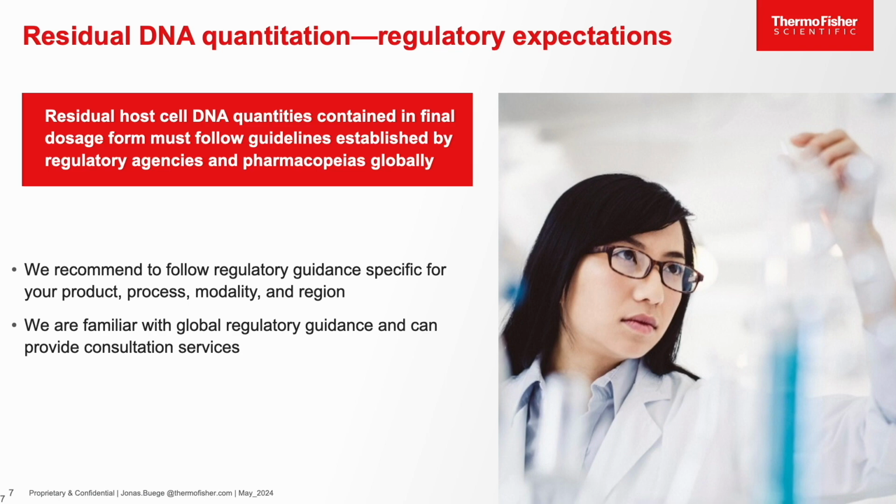Regulators around the globe, therefore, require you to limit the amount of residual DNA in the final dose. The World Health Organization, for instance, indicates that the amount of residual DNA per dose is kept below 10 nanograms. Residual plasmid, as an example, is also part of that 10 nanograms per dose limit, along with host cell residual DNA. For gene therapies, especially for neurodegenerative diseases, the FDA indicates that the host cell DNA content is to be kept as low as possible and that you are using a highly sensitive method to determine DNA levels.